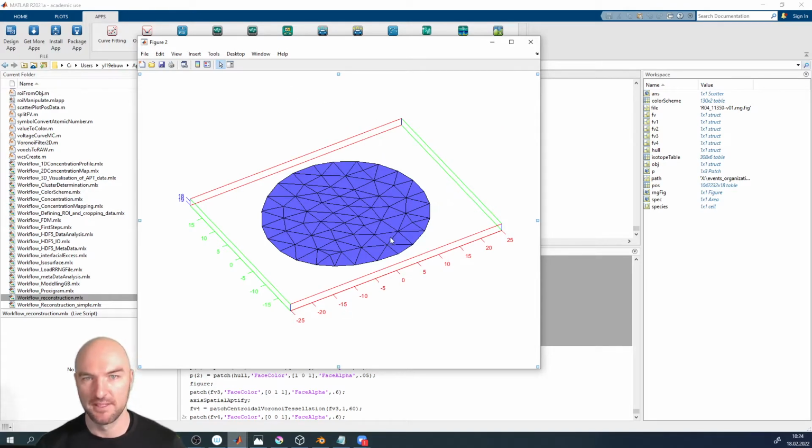And this is only going to be important if we do lateral analysis. But you can already see that there are some issues, and this is something I call trapped vertices. So here you've got something that kind of looks like a quadrilateral, but you have one vertex here that, in your Lloyd's algorithm, is always going to be trapped topologically by the neighboring vertices.